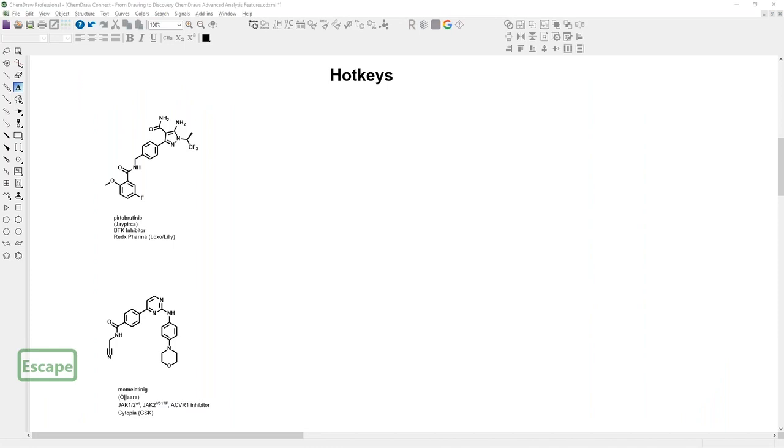And so even though the focus for today's session is really on the structured analysis, so the different features that Signals ChemDraw Professional gives you in that regard, I still wanted to start with a bit of a recap, a refresher on how I can quickly draw structures from scratch, because from my personal view, this is the one feature that I would always recommend people getting into, as long as you have to draw structures from scratch and do this on a regular basis.